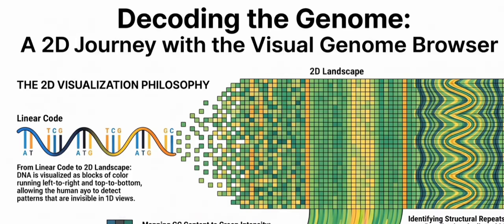Let's say you use that tool to extract the RNA-directed RNA polymerase. Which is the crucial engine the virus uses to copy its own genetic material. So I now have the Zika replication engine copied to my clipboard. Next, I navigate entirely out of the Zika database and I load the genome for a completely different virus, Boy.